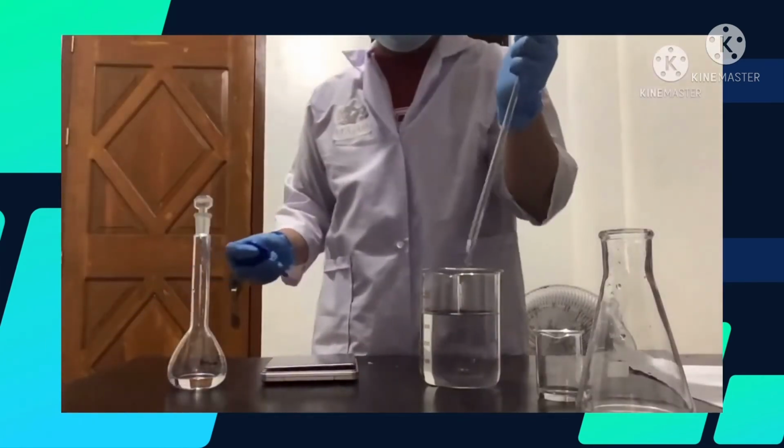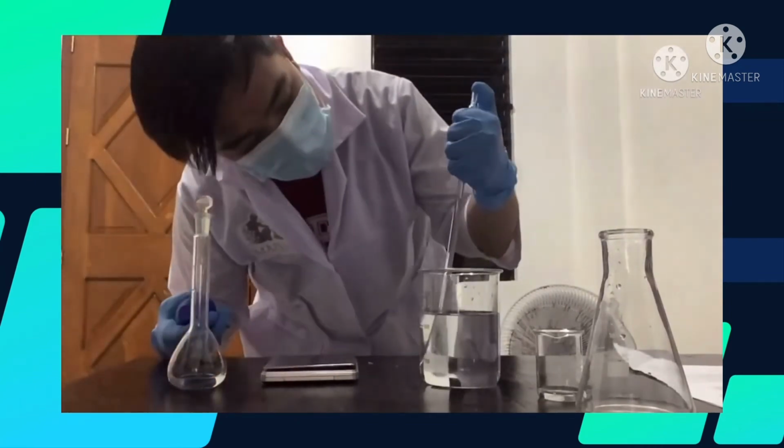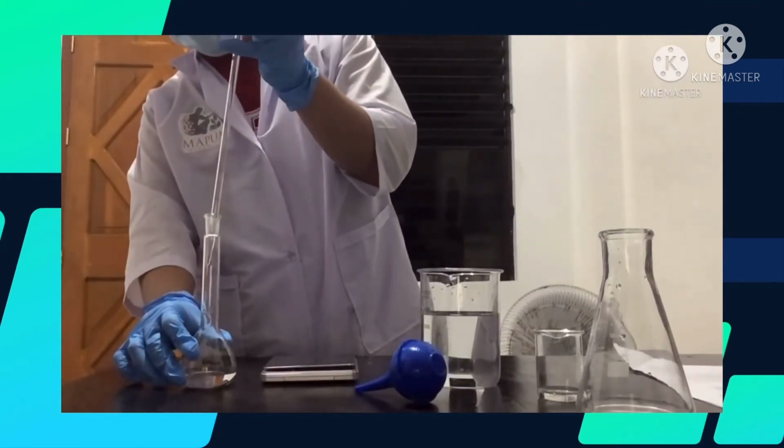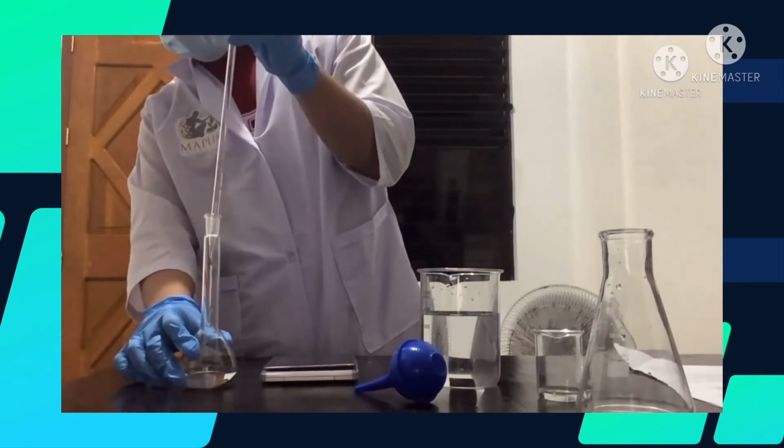In the same way, add a second 5 ml of water to the flask. Replace the stopper and once again record the mass of the flask with the water. Repeat this process until you have determined 4 consecutive masses of water.